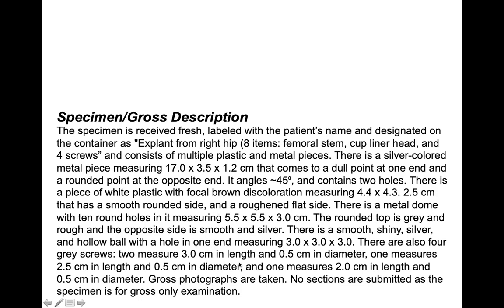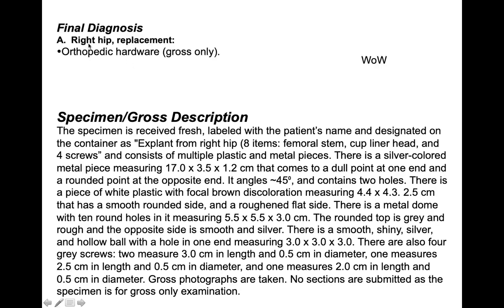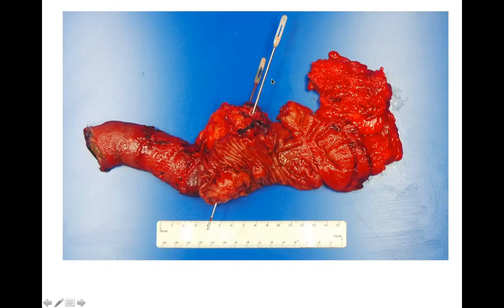There's gross photographs. There's lots of length and measurements taken. And wow, this was signed out with a one line as orthopedic hardware, gross only. Like just wow. So much text to so little text. It's quite amazing.